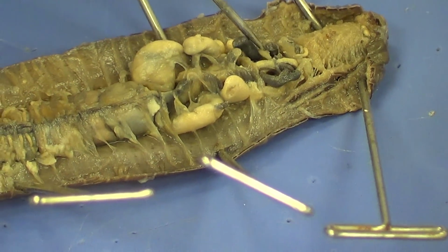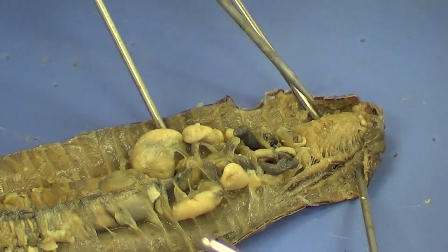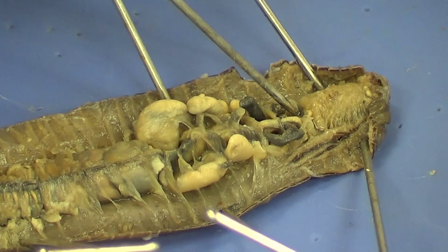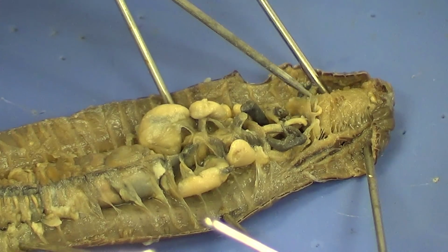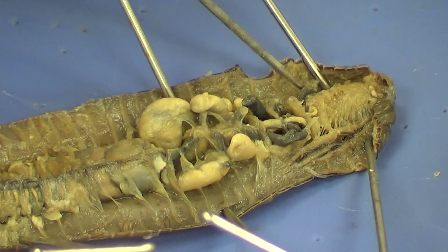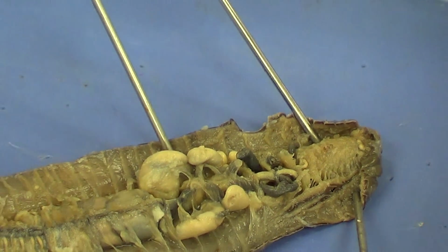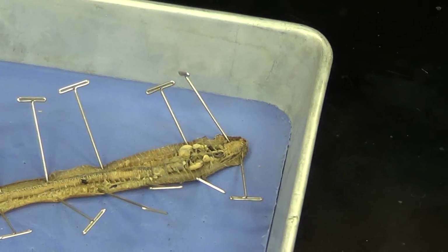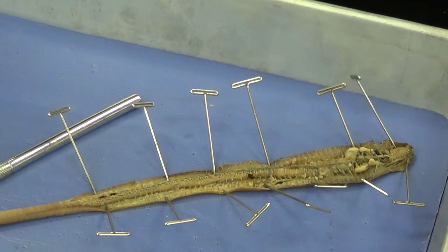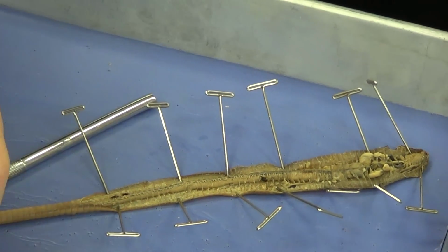And when you tease these, tease across the worm like this. You don't want to go this way because you'll just rip them in two. So you want to go this way. And maybe if you can get underneath one, lift it up just a little bit, just as I did there. You can see another one come into view. That's all you're going to get. Now, if you can get 2 or 3 of those, you're doing very good. There should be around 5 altogether. Sometimes a little bit more, sometimes a little bit less. There is no perfect worm.